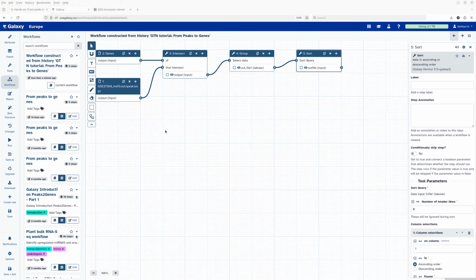As a more sophisticated approach, we could think about doing the same overlap we did before, but this time not just overlapping this broad peak area that is specified in the file, because the peaks can be very broad and there might not be that much content at the borders. We could instead search for an overlap with a peak summit. The peak summit means the area where the most amount of reads fall into.